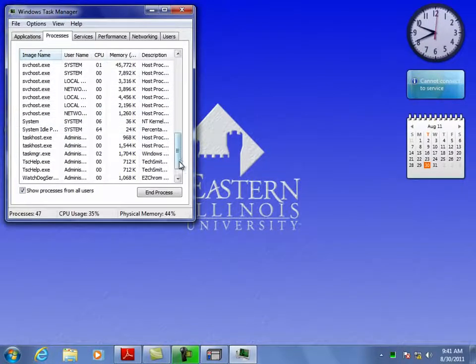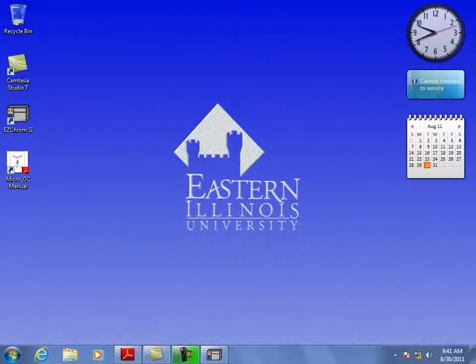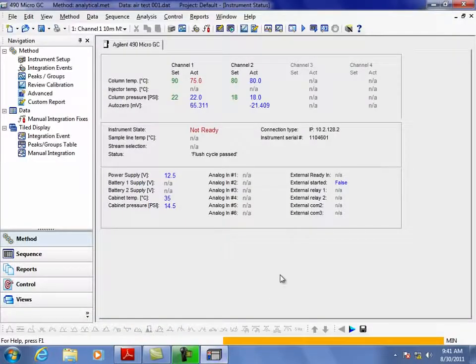Got all those service hosts open. My services are all open on it. Yeah, the ready light came on, then it went off. There we go, it just came up. And it's not now because it's trying to reach the temperatures.